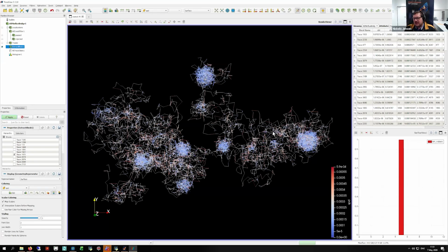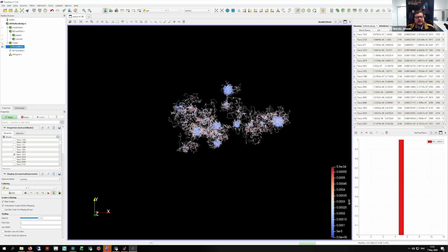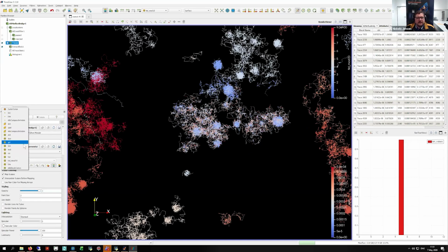Interestingly, you can also analyze whether it moves differently in different parts of cells, or if the molecules behave differently when they are closer to something different. So you get the highest spatial and temporal resolution about the behavior of a protein, a lipid or a dye in a living cell.